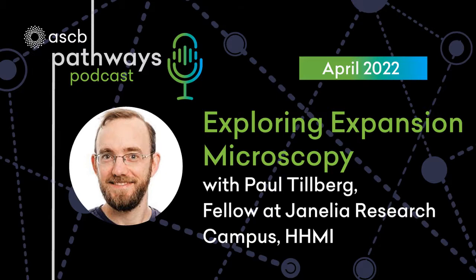Yeah. So it's not like you can't touch it, but it is something that in the quantities that we're using, you need to be careful. So I don't know what the restrictions would be around having high schoolers work with it. I think that you can have high schoolers work with this stuff safely, but that kind of comes down to what the regulations are on that. But the methods are definitely easy enough for somebody without extensive training to pick up. So you could definitely imagine doing this in a classroom setting.